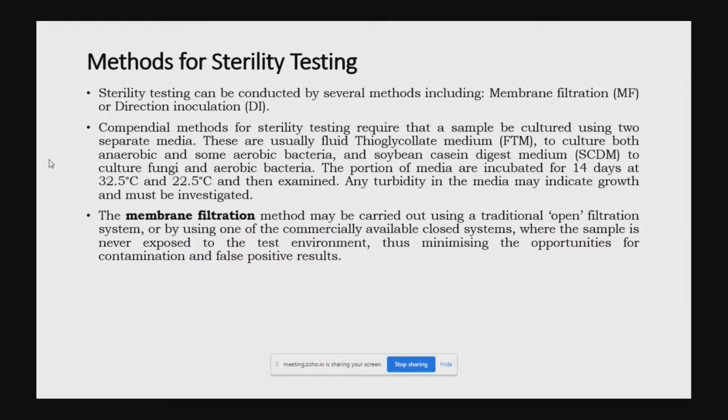Because sterility is a very crucial test for the patients. There are many microorganisms which are slow growers and may not be able to grow within a short period of time, like 5 days to 7 days. So we give the prolonged incubation time, up to 14 days. If there is any slow-growing microorganism, we can easily identify it. That's why we incubate the canister or tubes up to 14 days in the case of sterility.